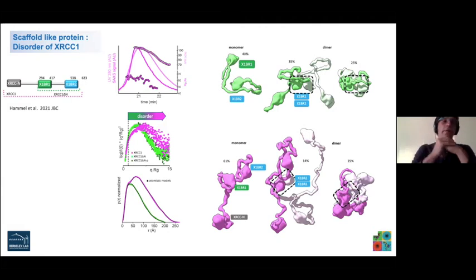For your apoferritin, I will show the example. The size is not the problem. The 804 column that we're currently using has 1.5 megadalton, and I think Rob can comment on the details. 1.5 megadalton is the maximum size, but we allow users to send us their own column too. Especially when we talk about an NIH project.